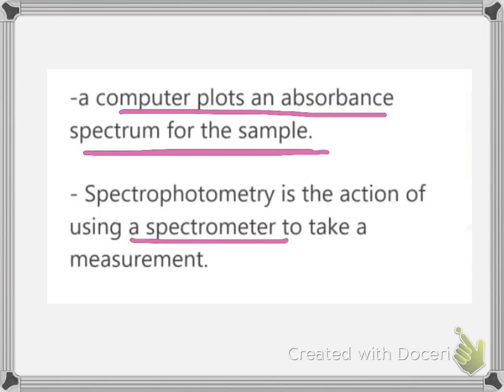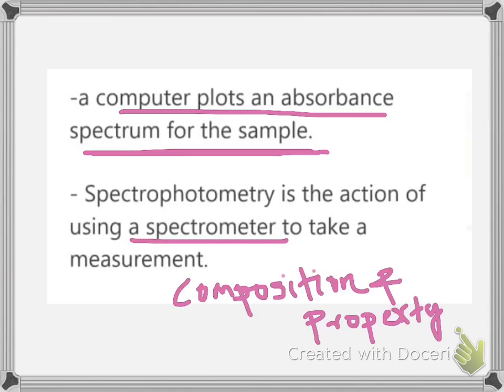The spectrophotometer is a tool which helps scientists and researchers to study the properties of light and the interaction of light with different materials. By measuring the amount of light absorbed by a sample at different wavelengths, a spectrophotometer can provide valuable information about the composition and properties of the sample.